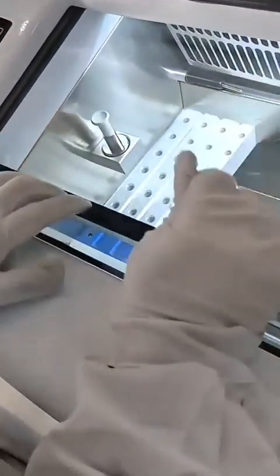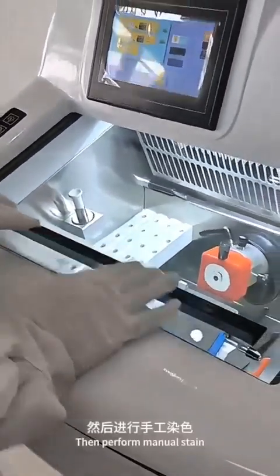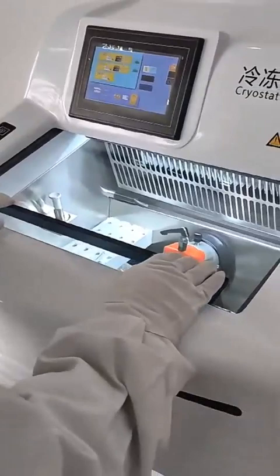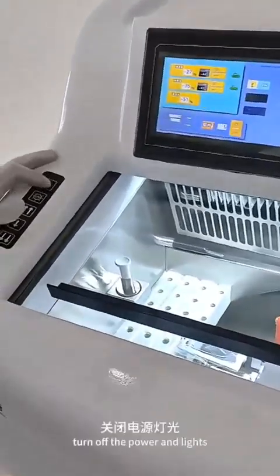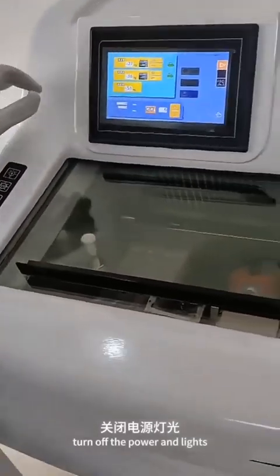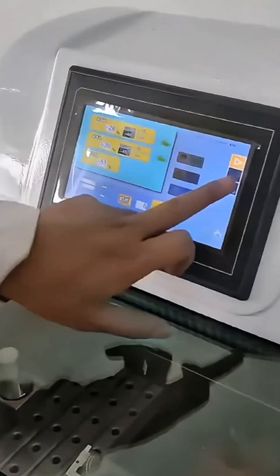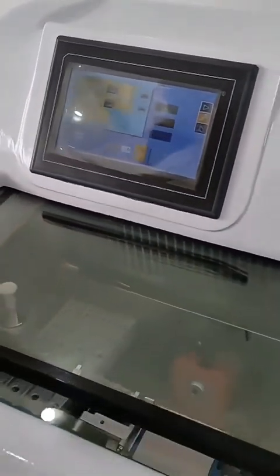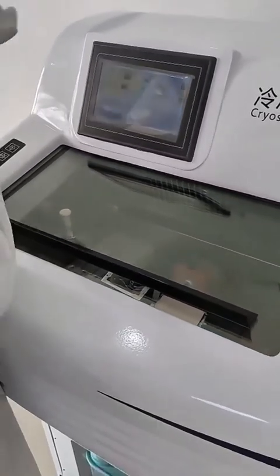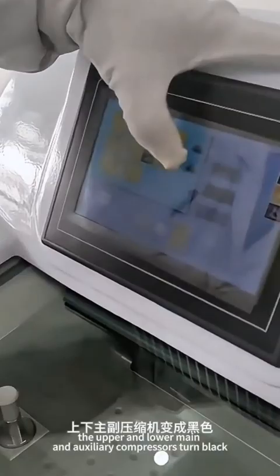Take it out from the side and the slide production is complete. Then perform manual staining. After all tissue slices are completed, turn off the power and lights to enter sleep mode. When entering sleep mode, the upper and lower main and auxiliary compressors turn black.